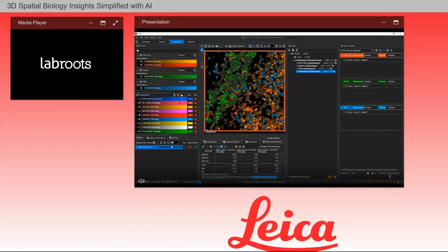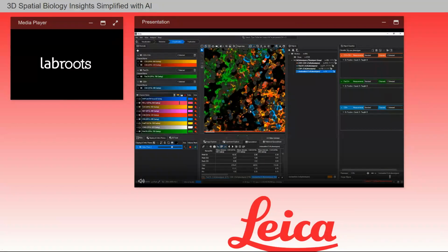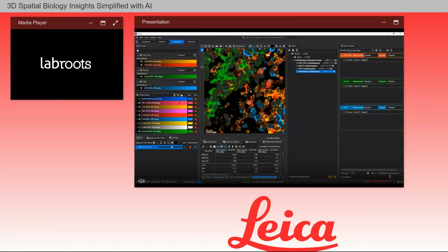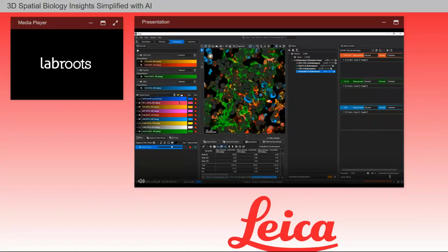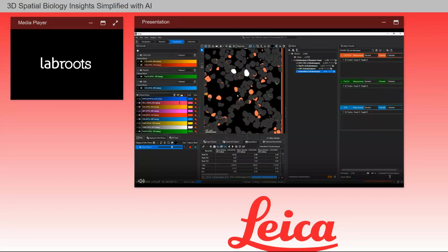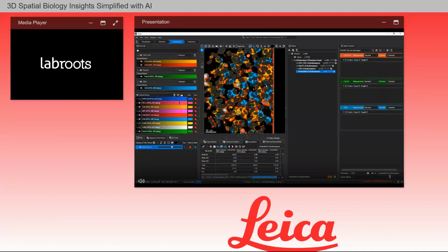Let's start by teaching the CD3, CD4 class. I am holding down the Control key and clicking on the cells to select them, and I'm panning around the entire image to select cells that appear to have CD3 and CD4 signals on them. For the phenotyper, you need as few as 2 cells per phenotype for training, but for a robust phenotyper, I would try to select a few more cells with different signal intensity and morphology around the entire image to make sure I don't miss anything.